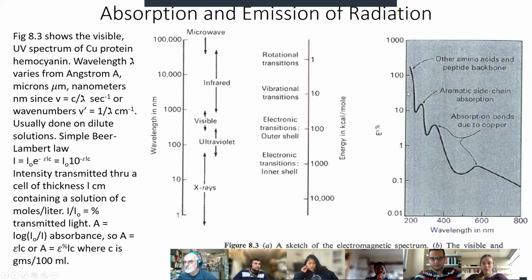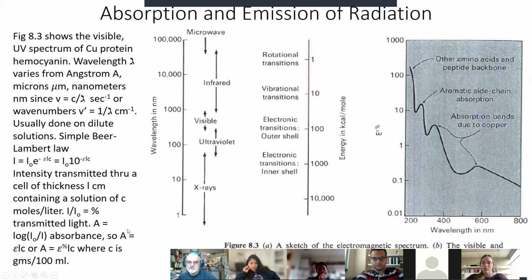And so taking the absorbance of this protein potentially gives you information about the copper, tryptophan, tyrosine aromatics, and the peptide itself. Now, what we normally do with this is measure the absorbance, and knowing the extinction coefficient and the path length, we can determine a concentration. So we usually use this information to get concentration because we know what the extinction is. Changes in the shape of these spectra potentially give you information about changes in the environment, which may reflect changes in different vibrational, electronic, or rotational states, or changes in the binding properties.